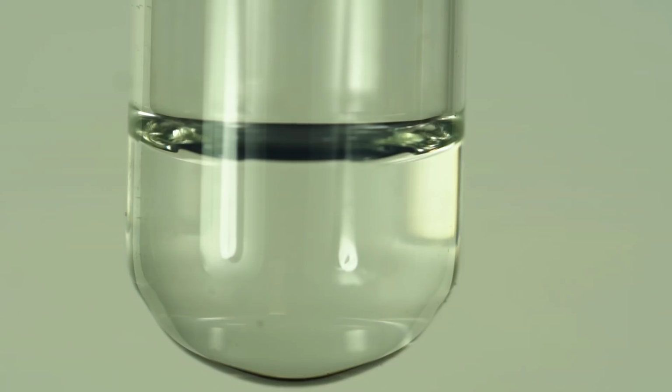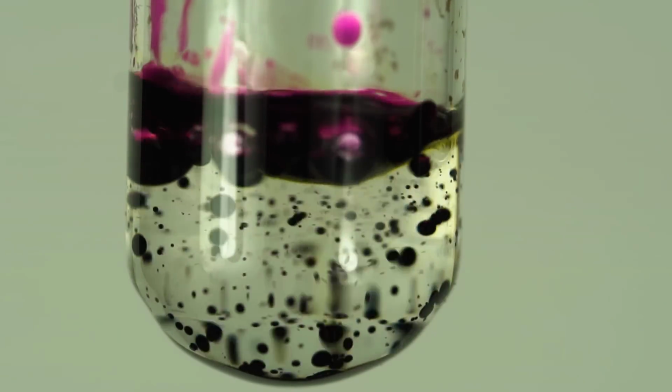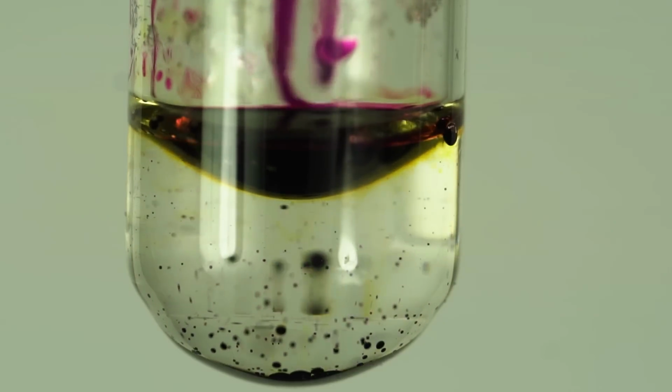The iodine dissolved in carbon disulfide reacts with aqueous solution of sodium azide, producing gaseous nitrogen that you can observe in the form of 1,000 tiny bubbles.